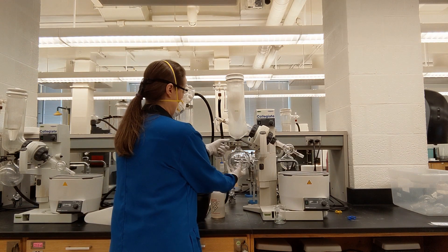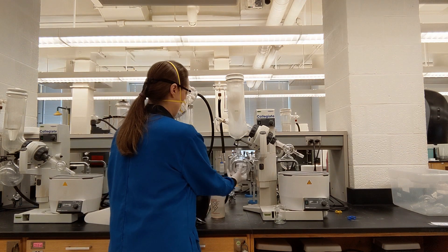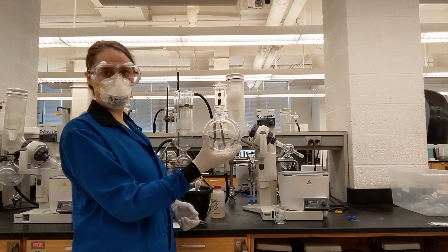All of my solvent that boiled off ended up here. This needs to go into a waste container.